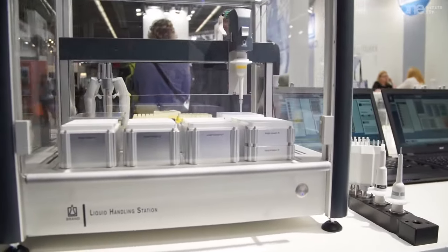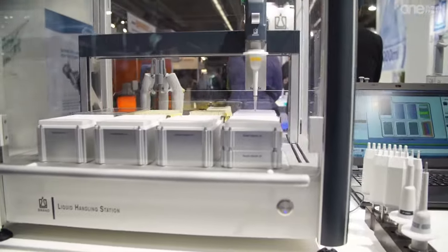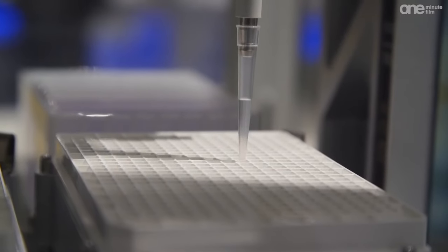The Braun Liquid Handling Station is a pipetting robot for moving liquids in the volume range of 1 microliter to 1 milliliter.